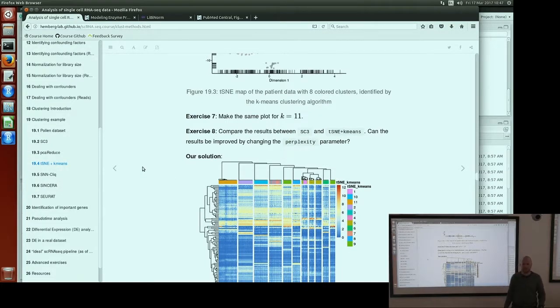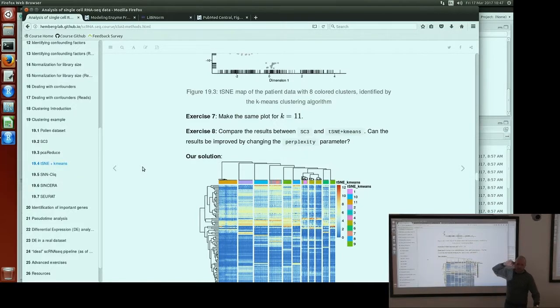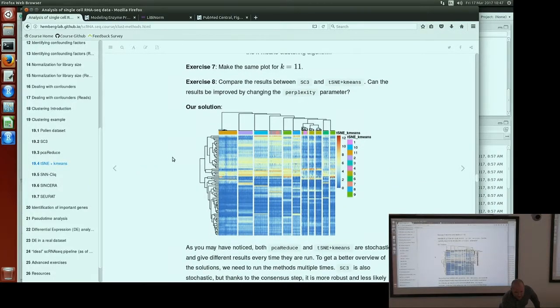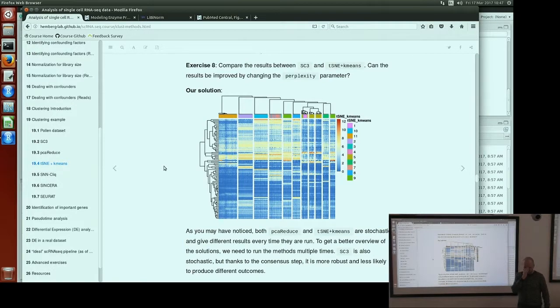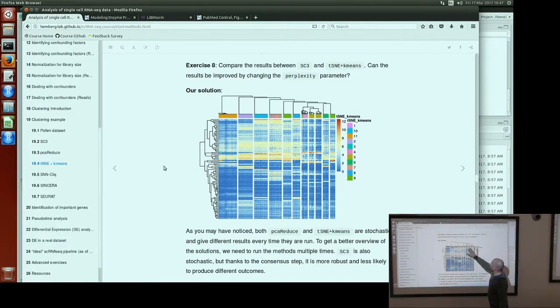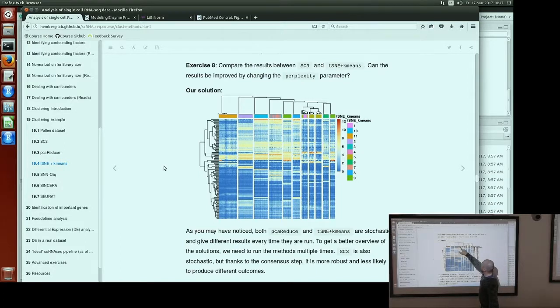You have a couple of exercises: make the same plot for k equals 11, running k-means for k equals 11. If we compare the results of SC3 and t-SNE k-means on the heatmap, it's probably not the best way to compare results, but at least it's something visual. For example, SC3 split a cluster defined by t-SNE into two clusters. Here we have quite a lot of t-SNE clusters in the same SC3 cluster.